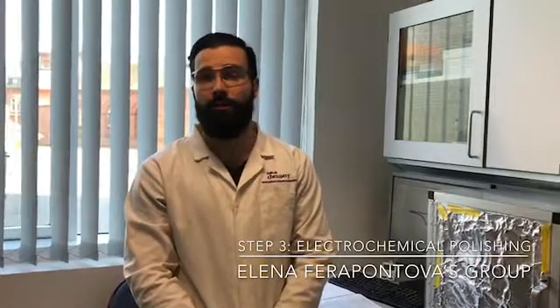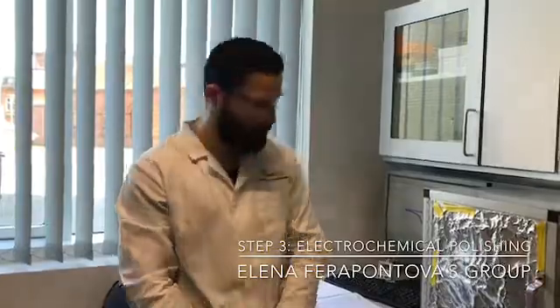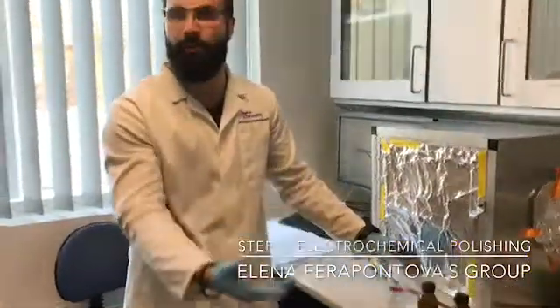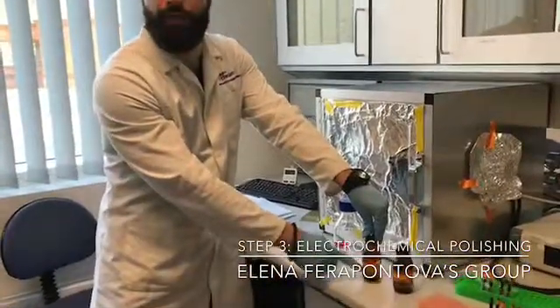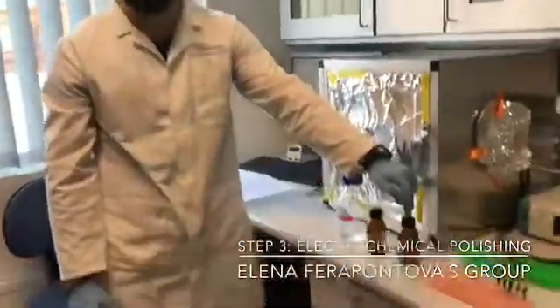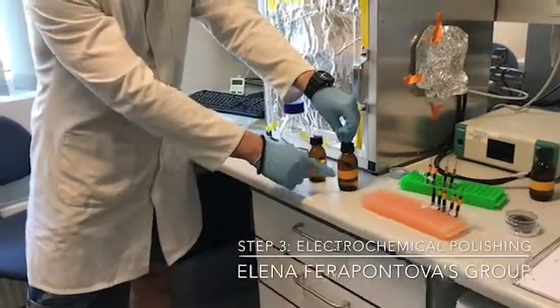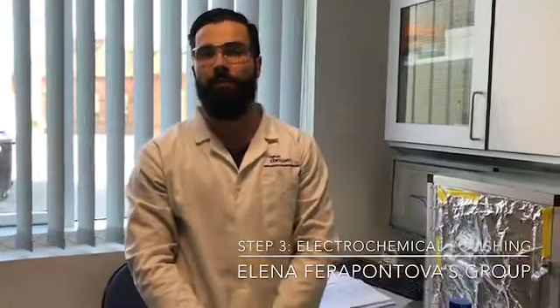This actually contains two steps. Step number one, you place the electrode into 1 molar sulfuric acid and you run cyclic voltammograms. Next, you put it in 1 molar sulfuric acid with 10 millimolar potassium chloride. And for the final step, you place the electrode into 0.1 molar sulfuric acid — this is only to calculate the electrochemical surface area of the electrode.